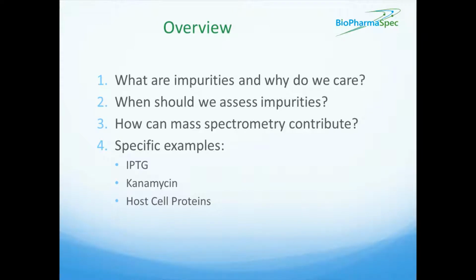So my goal for our talk today is twofold. First, I would like to provide an overview of impurity analysis, touching on each of the questions listed on the slide. And secondly, I want to give you a taste for the major role that mass spectrometers can play in the detection and quantitation of impurities. Now, to that end, I will briefly go over a few specific examples of actual mass spec impurity assays that we carry out regularly here at BioPharmaSpec.